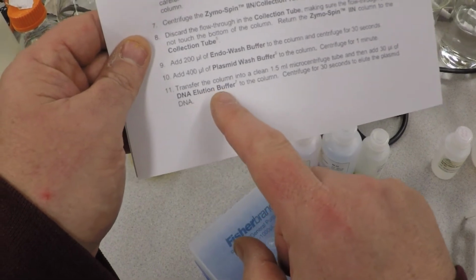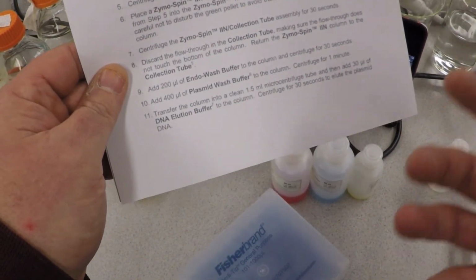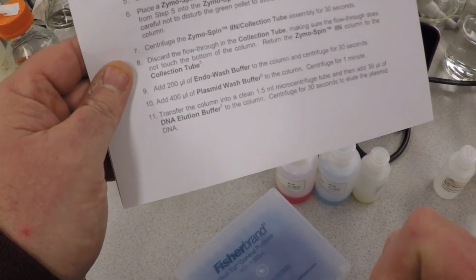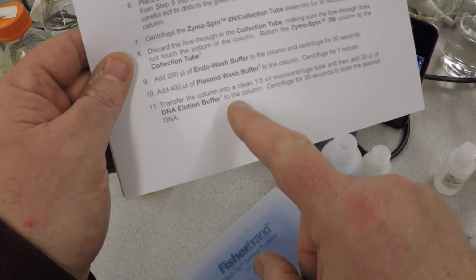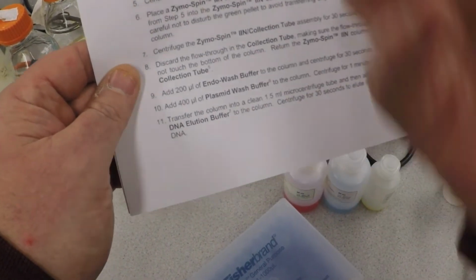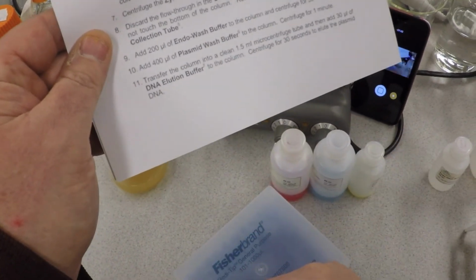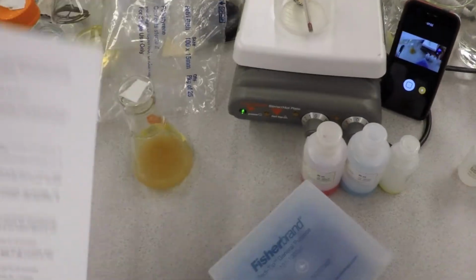Basically what this is, right now there's a lot of salt, and the DNA is stuck under those conditions to that white silica stuff in the bottom. But now if we suddenly add a bunch of very low ionic strength stuff, i.e. something that's basically water, now the plasmid will fall off of that matrix and it will come through. Now we want to save what comes through, okay? So we're going to put a very small amount, 30 microliters is a good amount.